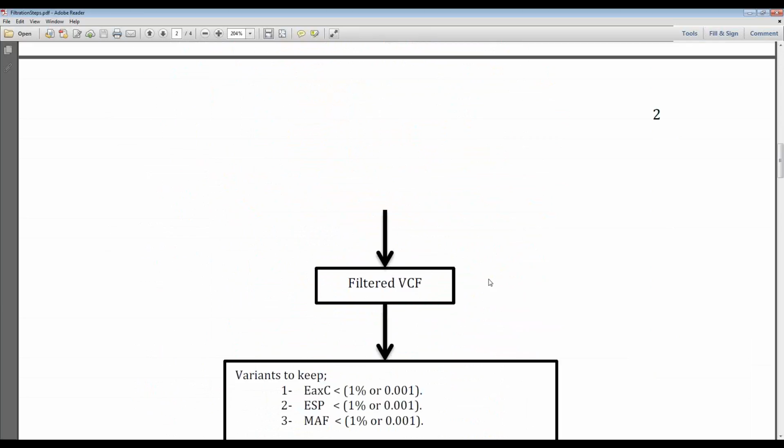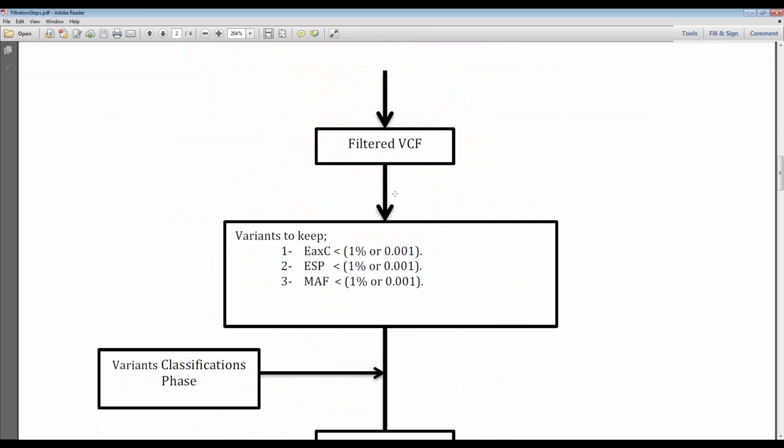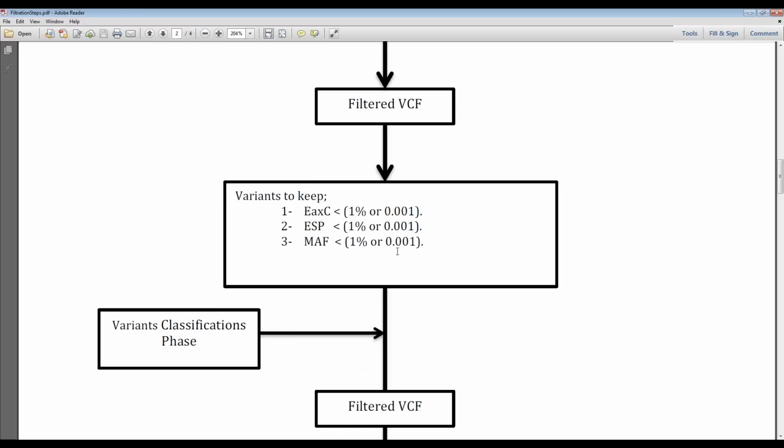That's basically until we come to what we will be focusing on more in today's talk, which is what we call the filtered VCF file. When we reach this, that's where we start loading our samples into Golden Helix. I will show you now how we created the customized tools and filters after loading the VCF file, where we can pinpoint a single variant, and how we worked with Hauwa in designing our customized report that will fulfill our requirements.